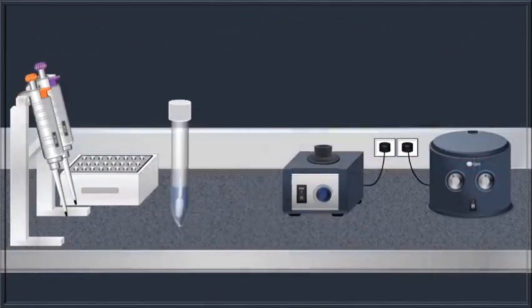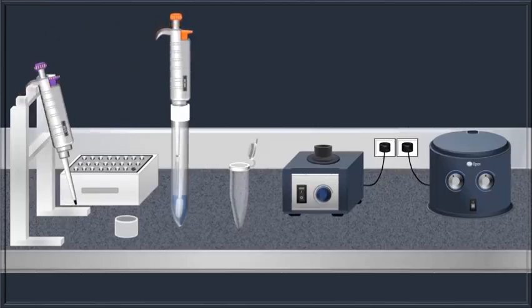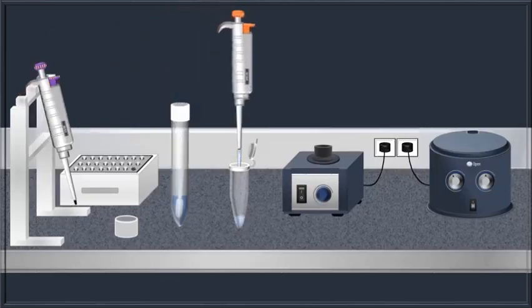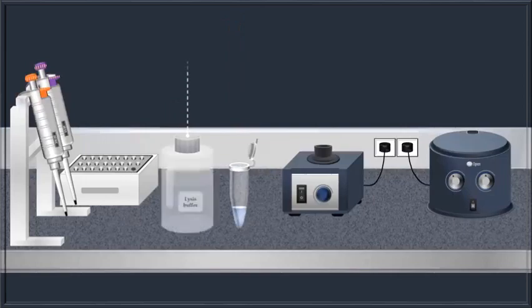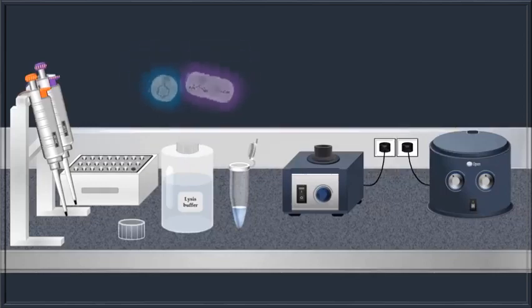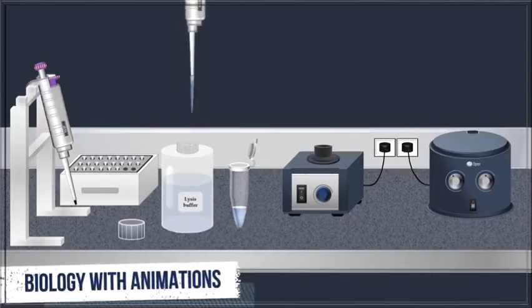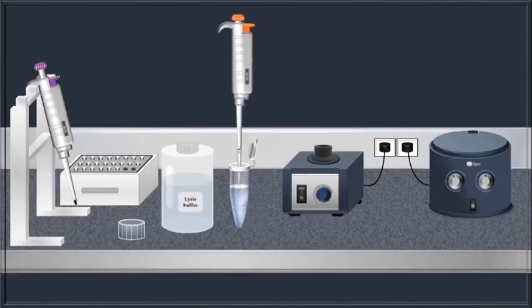To perform this method, basically viral RNA should be extracted. Several RNA purification kits are available for convenient, fast and effective isolation. To extract the viral RNA by using a commercial kit, the sample is first added into a microcentrifuge tube. Then it is mixed with a Lysis Buffer. This buffer is highly denaturing and usually consists of phenol and guanidine isothiocyanate. Also, RNase inhibitors are usually present in the Lysis Buffer to ensure isolation of intact viral RNA.